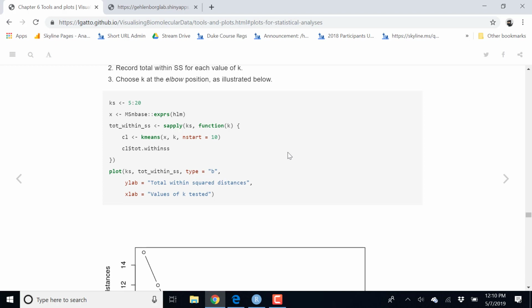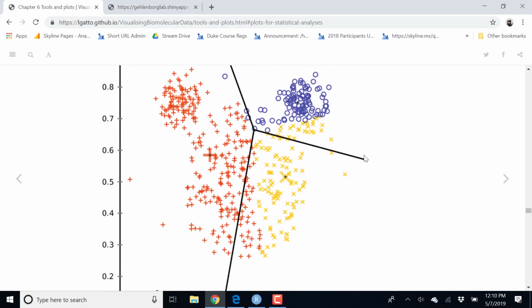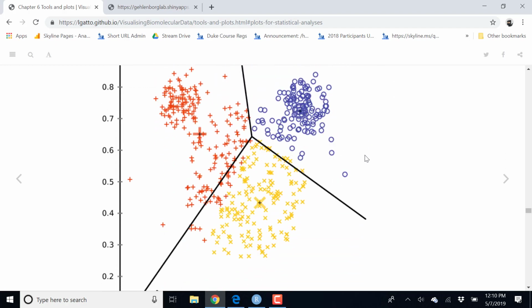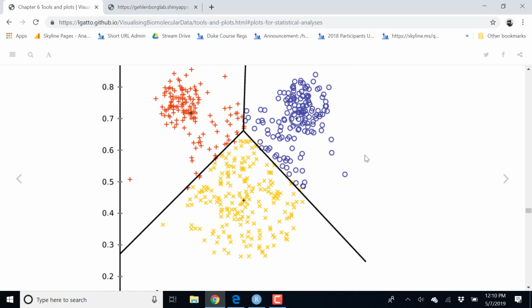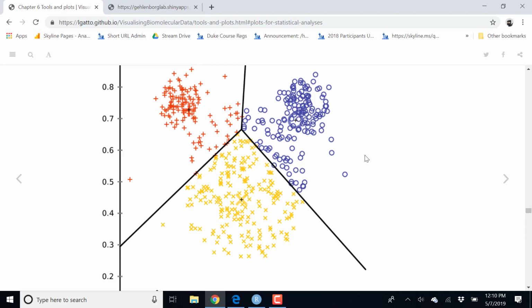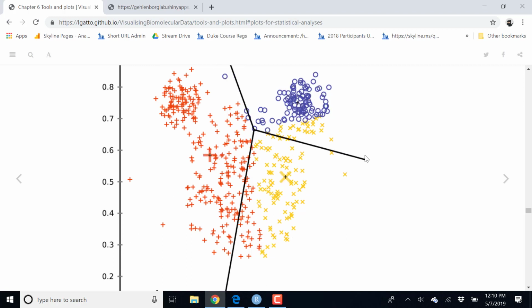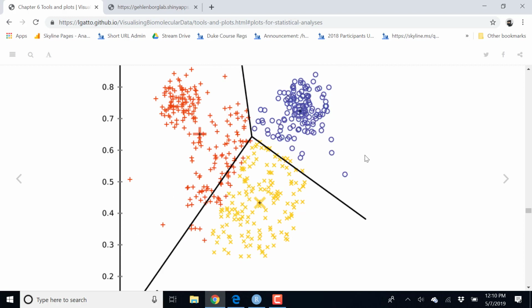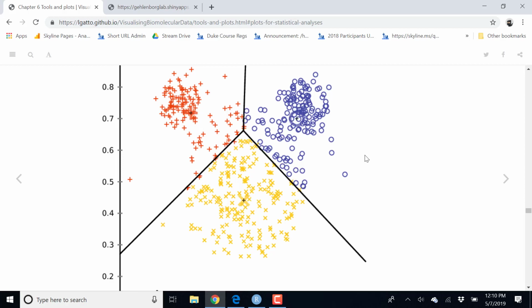And so if we look at here, assuming that there is some, even if there is no clustering structure, the differences should be relatively minimal, right? So in the beginning of iterations there is a big change, but when we look here, now the changes at every iteration become quite minimal.